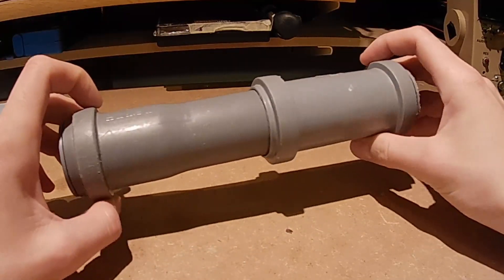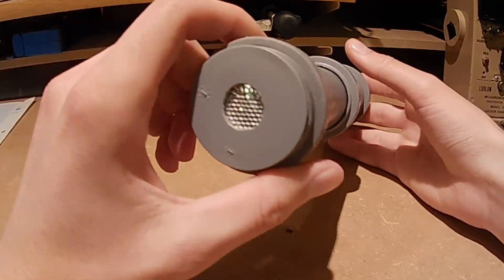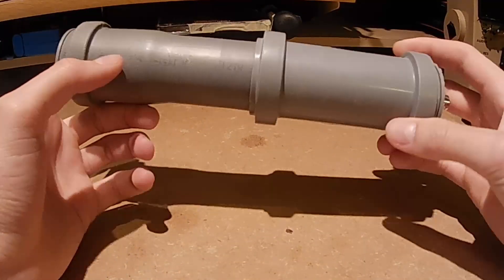This is an alpha-beta-gamma scintillation detector. It can detect alpha radiation, beta radiation, and gamma radiation, and I thought I would describe how I built this in this video.